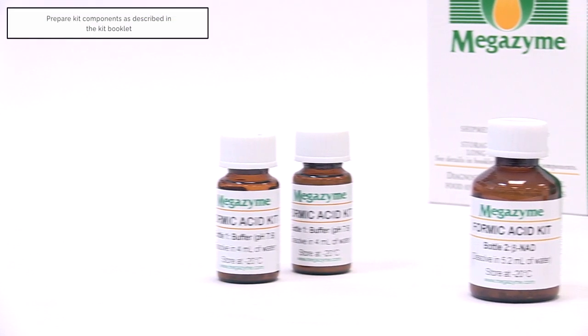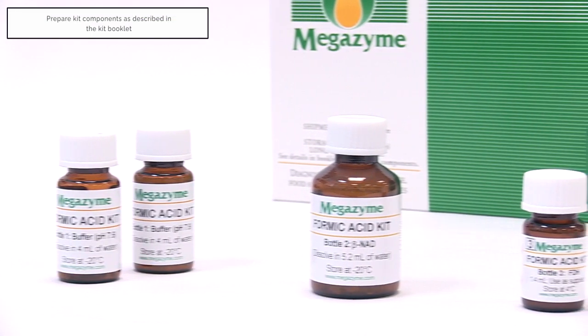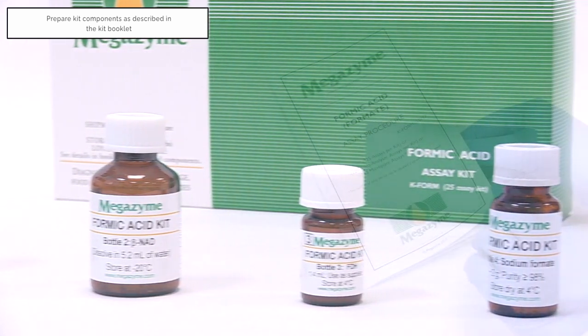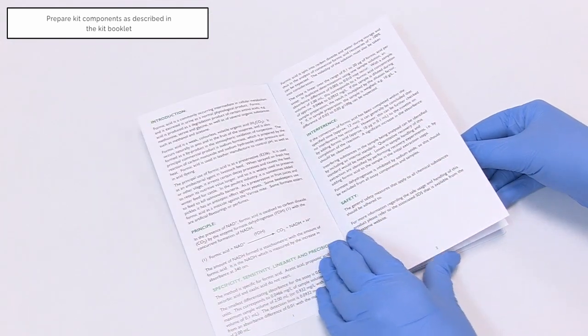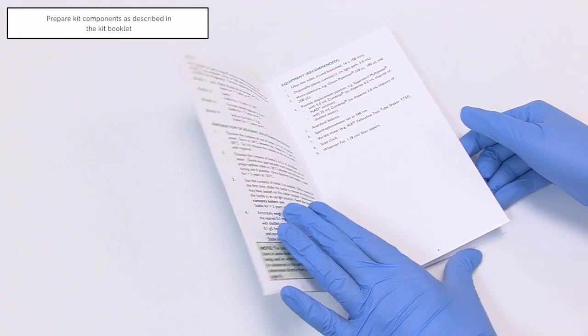Prior to sample analysis, the kit components should be prepared as described in the kit data booklet. Once prepared, they are ready for use in the manual assay procedure.